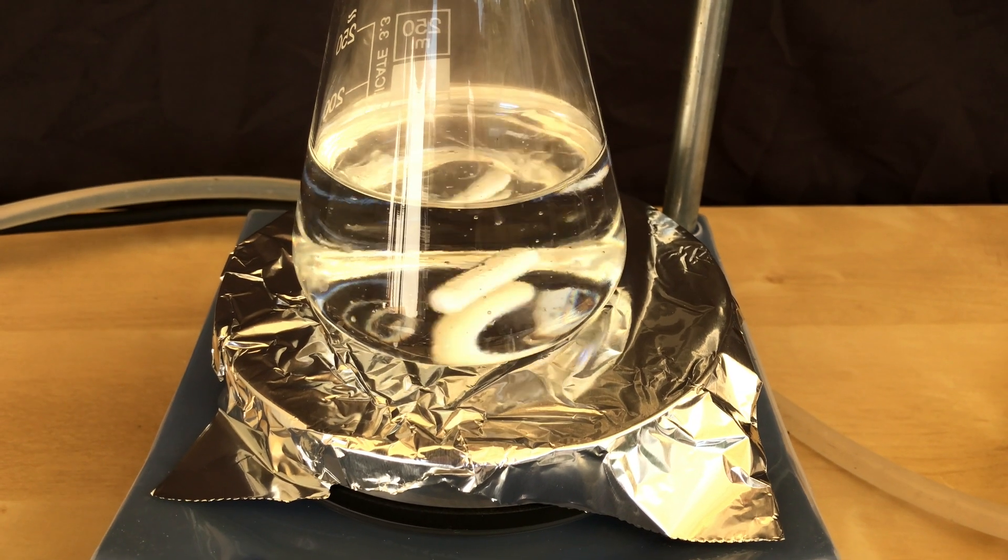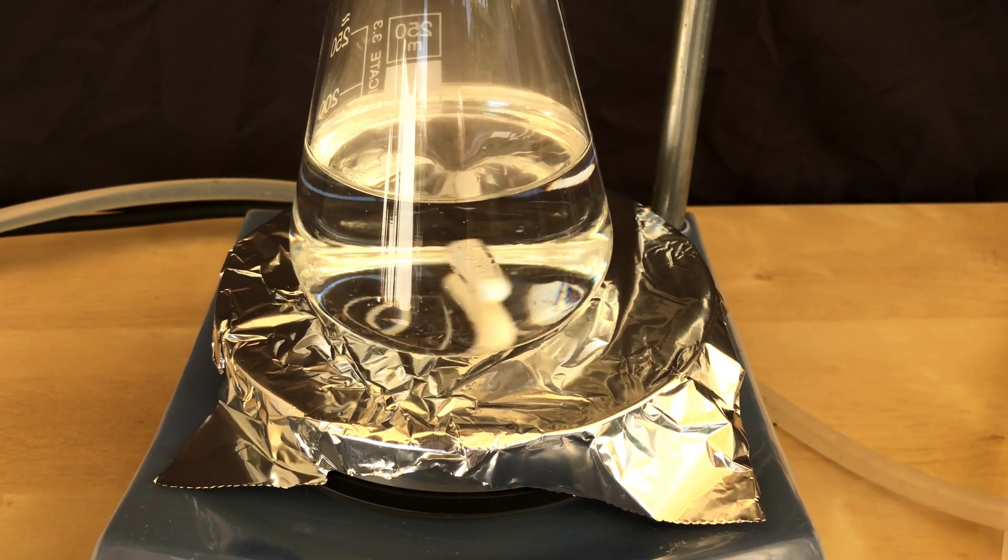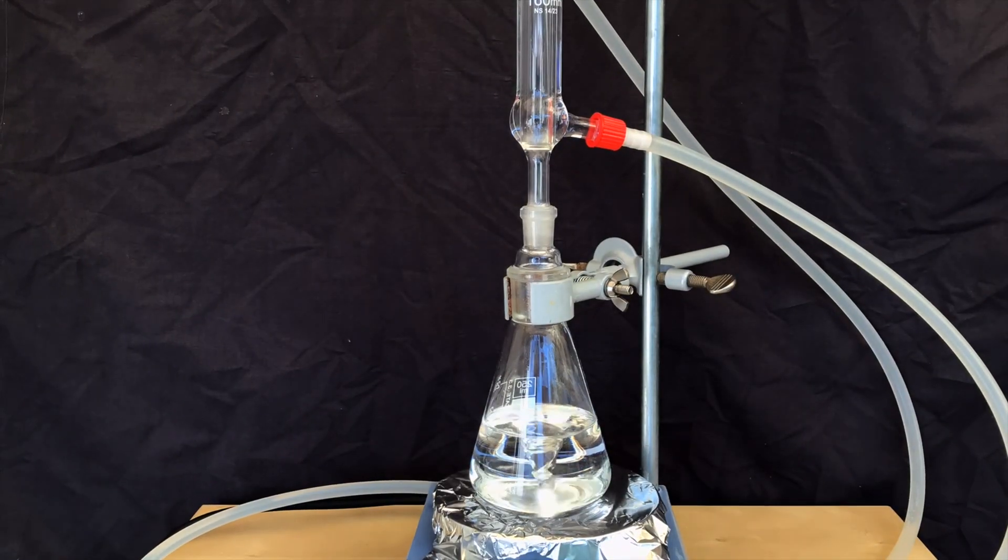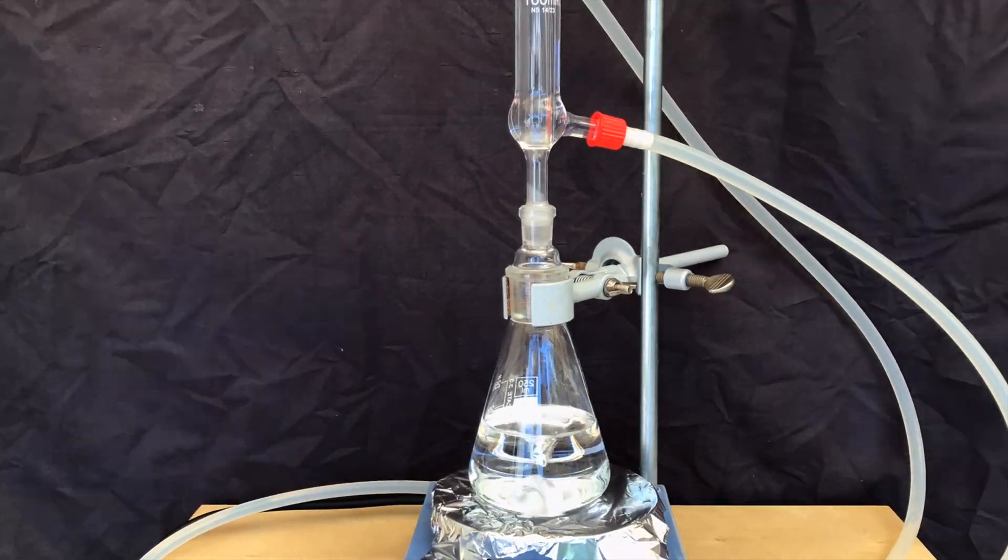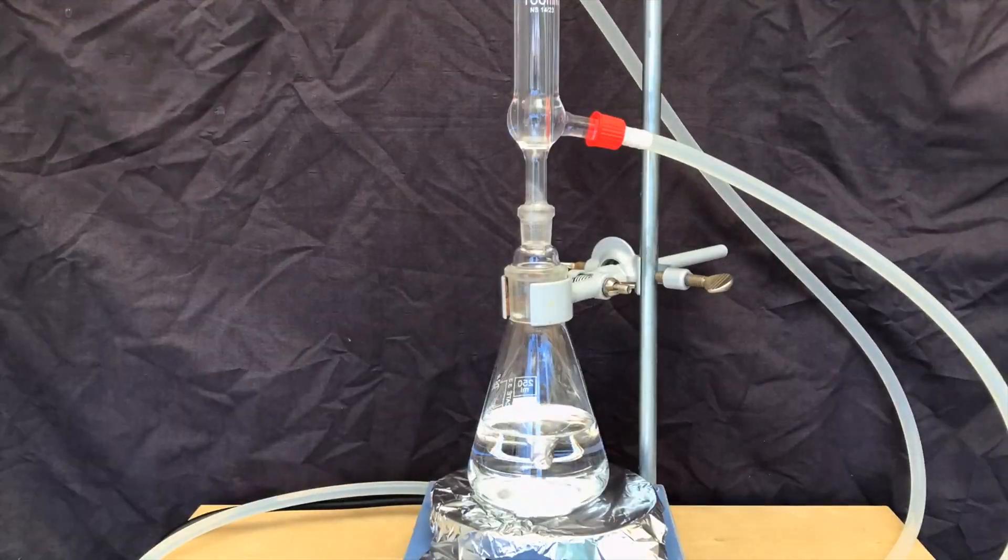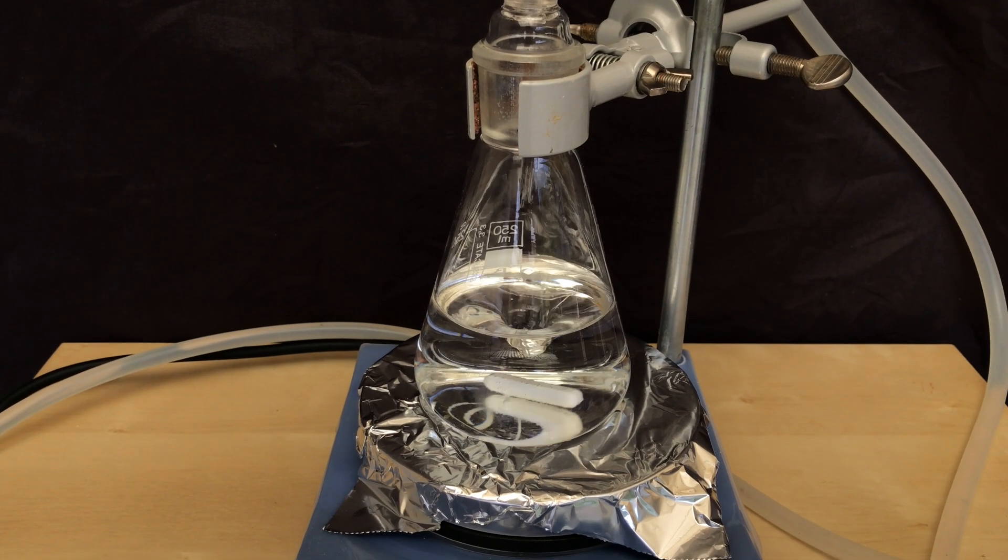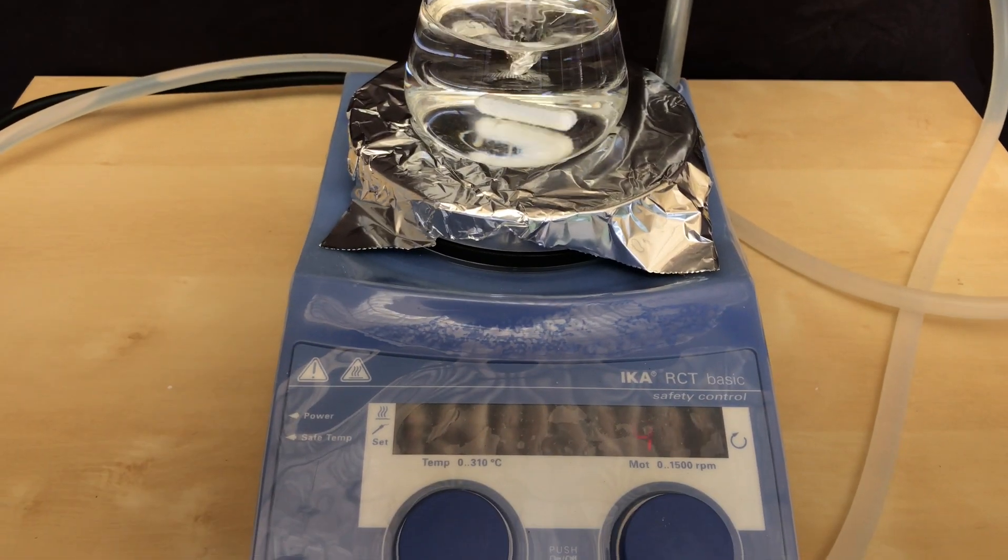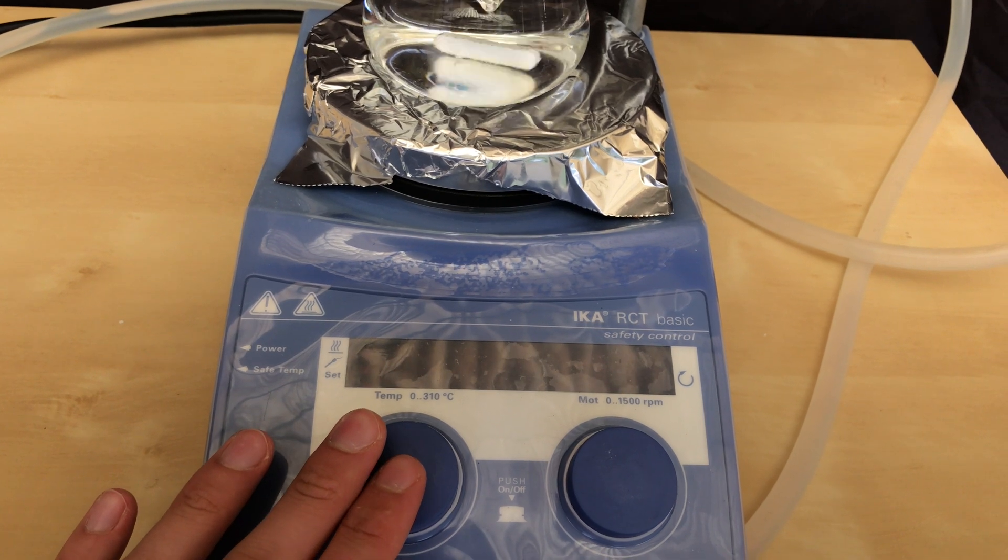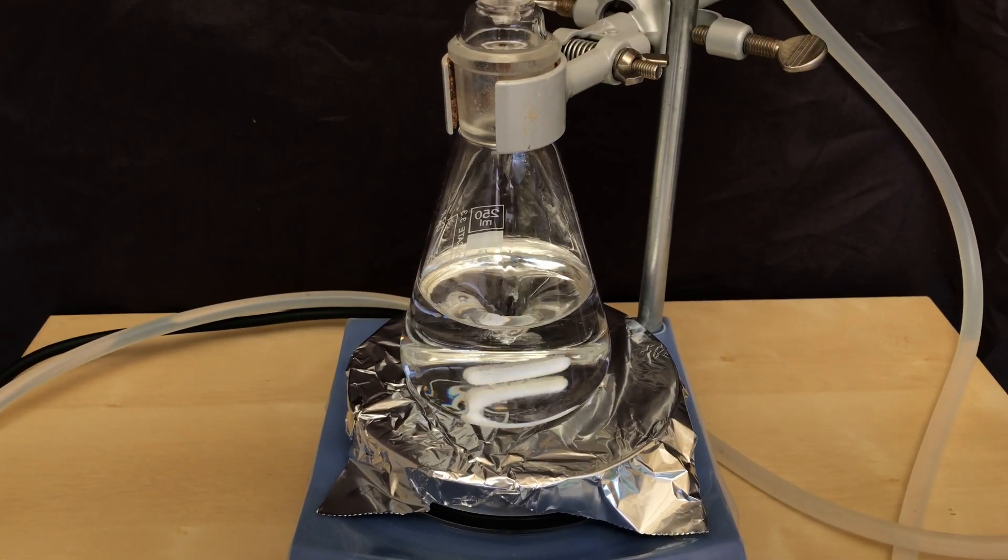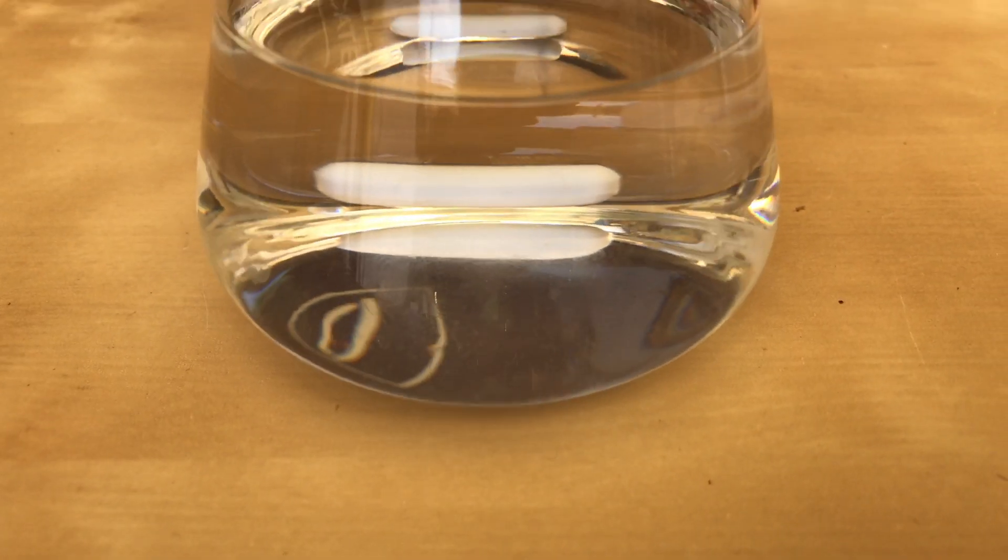A reflux was set up and heating and stirring were then turned on. To ensure complete hydrolysis of the DMF we refluxed for 5 entire hours. During this time the DMF should hydrolyze to form formic acid and dimethylamine which later reacts to form dimethylamine chloride. The moment the 5 hours passed, the hot plate was turned off and we allowed it to cool back down to room temperature.